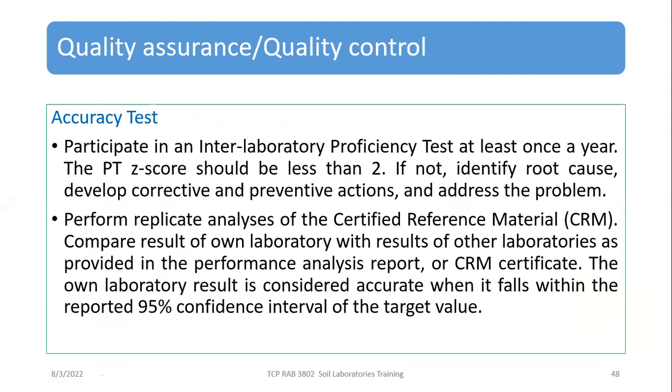For quality assurance and quality control, we have to come to the accuracy test. Participation in inter-laboratory and international laboratory proficiency tests is very important. Very good that now FNAR participates in this proficiency test, as Lucrezia mentioned in the beginning of this training session. Also, use of certified reference material is recommended.